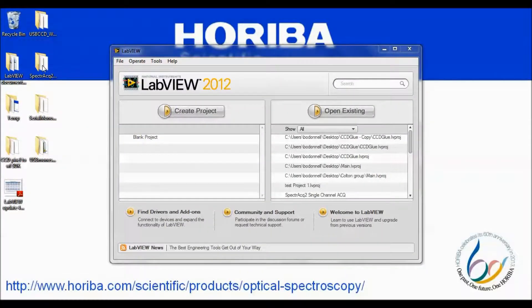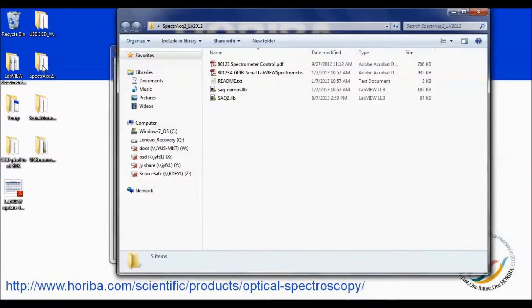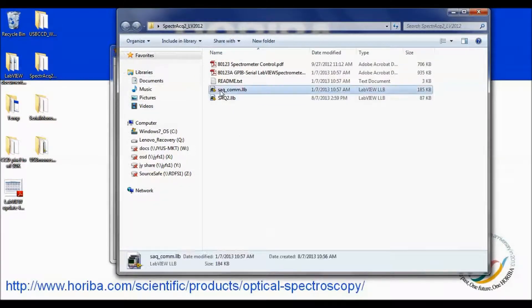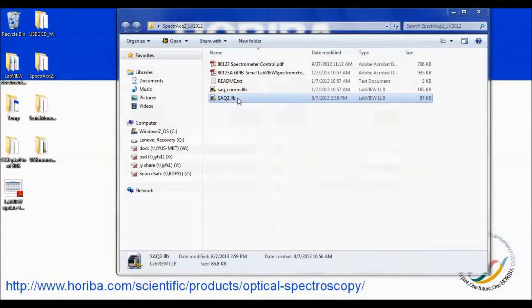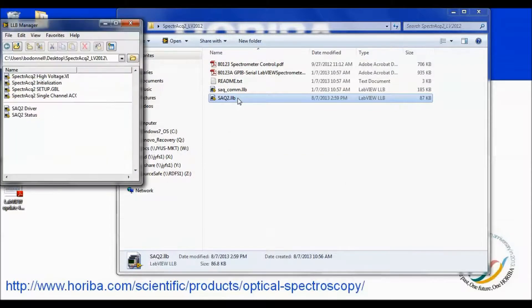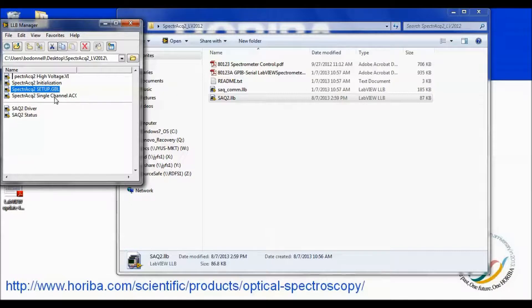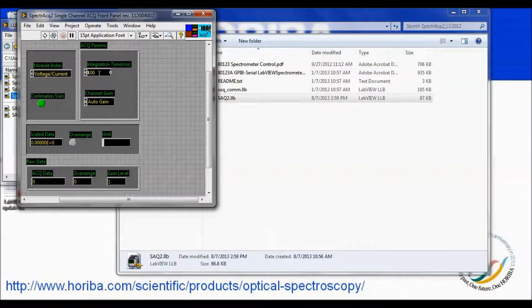Finally, the SPECTRAC2, which is used to acquire data from single-channel detectors, also has a set of libraries. The library labeled COM controls communication through the serial or GPIB port. The library entitled SAQ2 contains all of the sub-VIs needed to interface with a SPECTRAC2, including setting the high voltage, initializing, and acquiring data. As was the case with the serial spectrometers, the communication parameters are stored in the setup global file. The demo program entitled single channel ACQ allows the user to set an integration time and gain, as well as obtain results as raw data or with the scaling factor included.